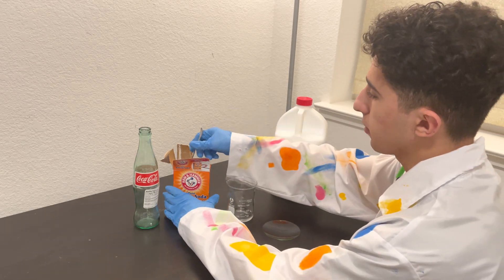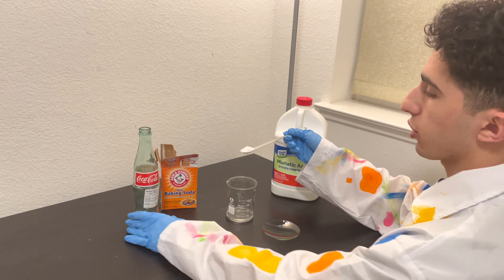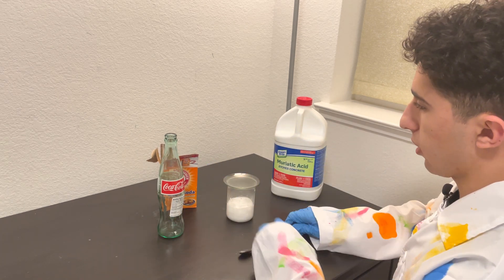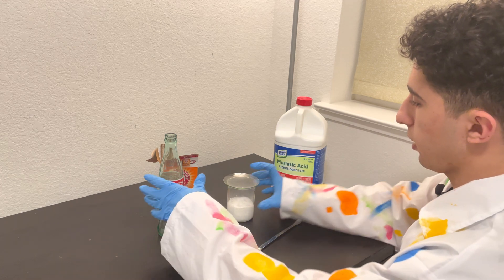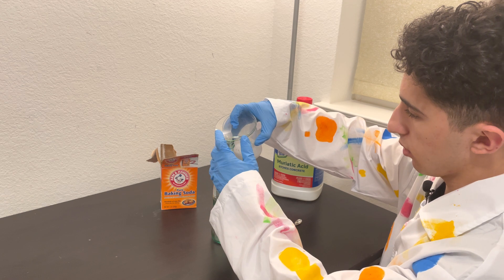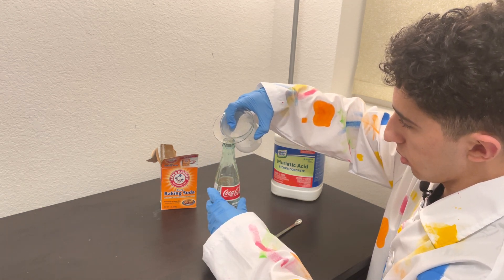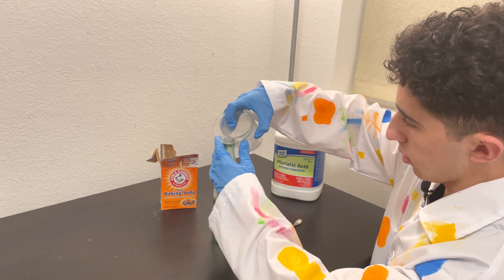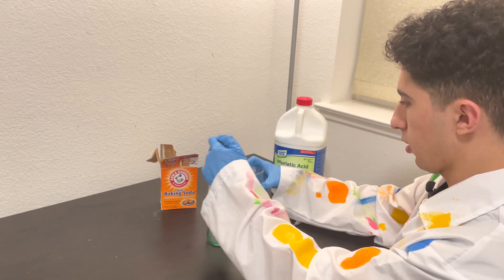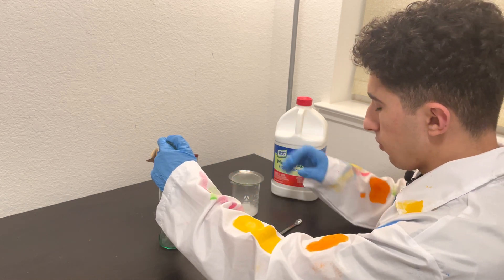What I needed to do was react the HCl and the baking soda in the beaker, then quickly cover it with a watch glass to minimize the loss of CO2. Then I would tip the beaker over the Coke bottle to essentially pour the CO2 into the bottle, being careful not to accidentally pour any acid. Once most of the CO2 had been poured into the bottle, I would cover the top of the bottle as quickly as possible with my thumb.